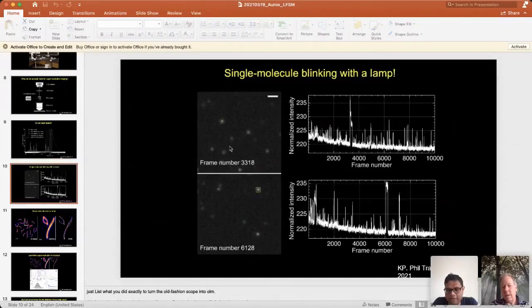Another advantage with these amphibian nuclear pore sections was these are very thin membranes. So we kind of get optical sectioning also from them, and then we have to bleach less. So if you go in tissues, it will be much harder, but in flat samples, it's much easier.